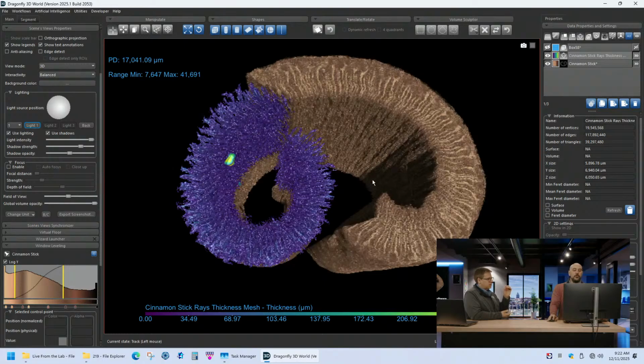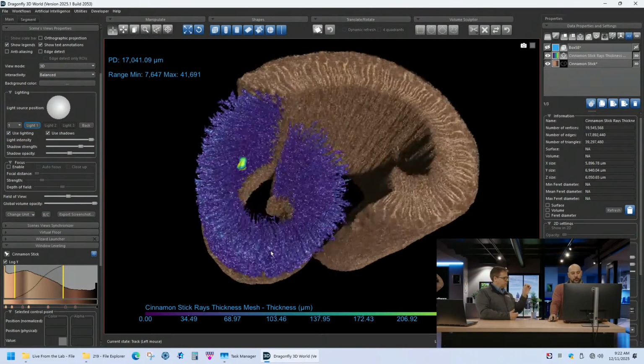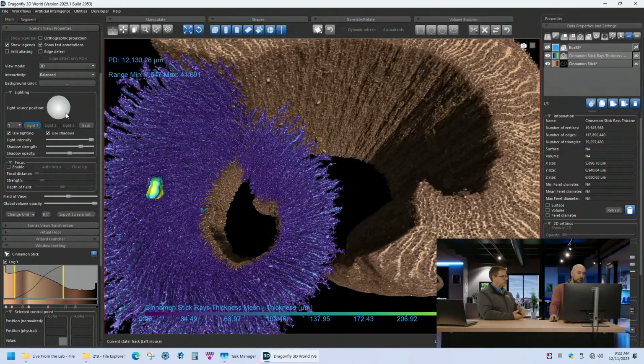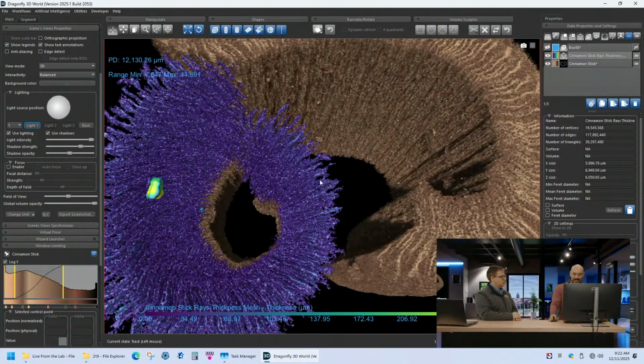And so these little rays, the other thing we can see is that they're actually just independent little fluidic channels. They're not like sheets or anything like that. You can start to get that sense for what they are. Yeah, I suppose that's why this is really good for sticking in a drink. Yeah, exactly. It can suck them up.